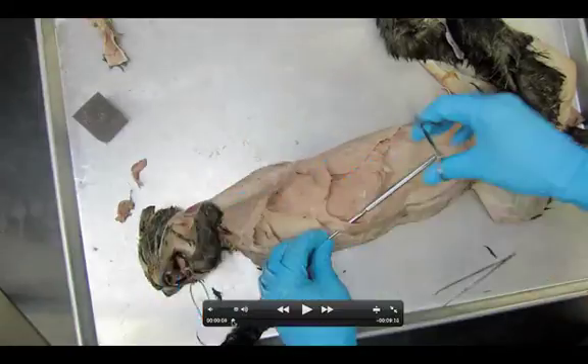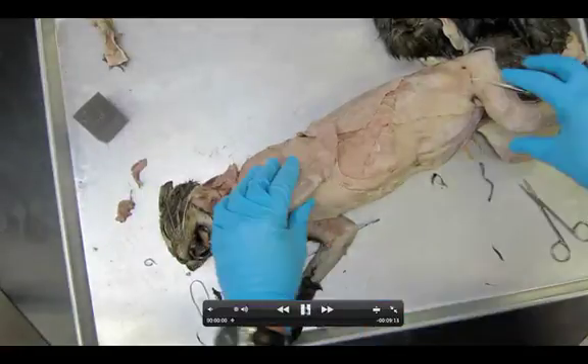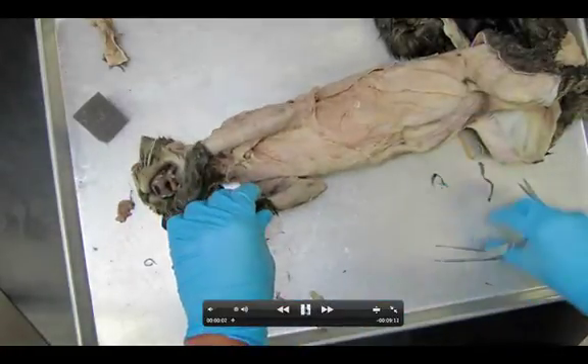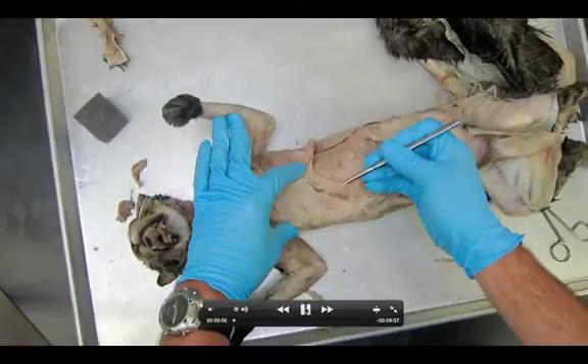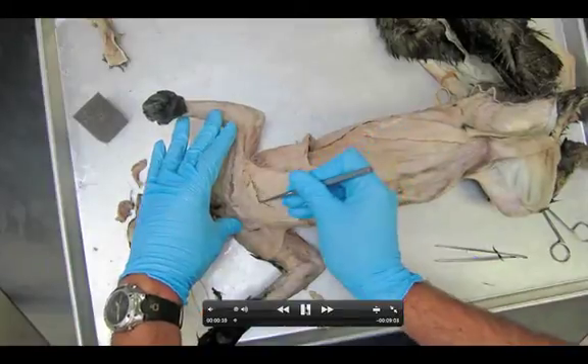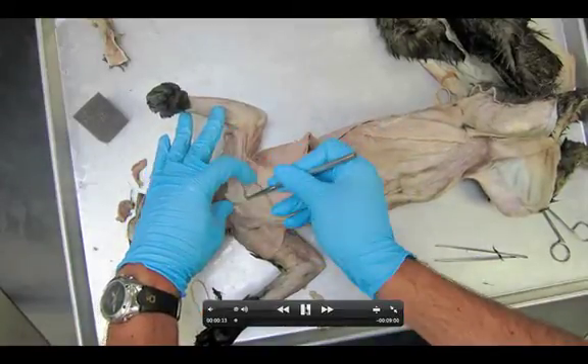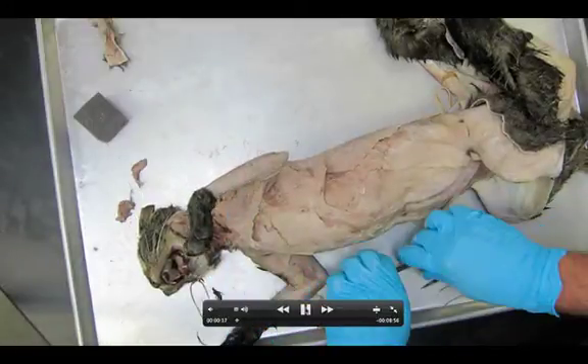Welcome anatomy students. Here we're taking a look at dissection number seven. This is the pre-lab video that we need to have watched before dissection seven is begun in class. Today we're taking a look at the deep chest muscles of the cat for dissection seven. To start out we're going to have to actually cut through all those pectoralis muscles that you spent so much time dissecting in an earlier dissection.